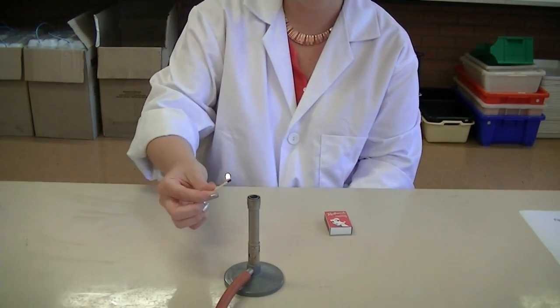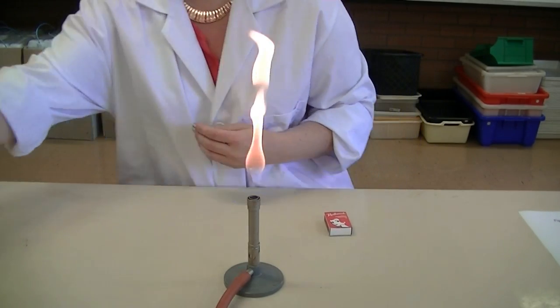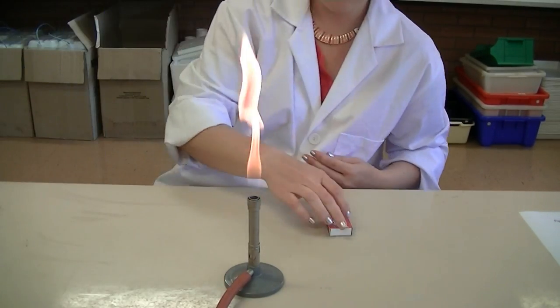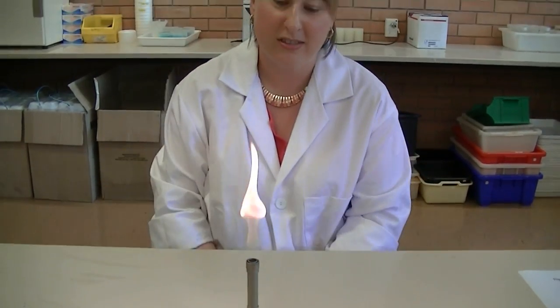You should hear the gas coming out and then you can light your flame. Your match can be disposed of in the pipette bucket. When you're not directly using your flame, you should have it on the orange flame so that you're aware that it's there and that you don't accidentally wave your hand or arm through it.